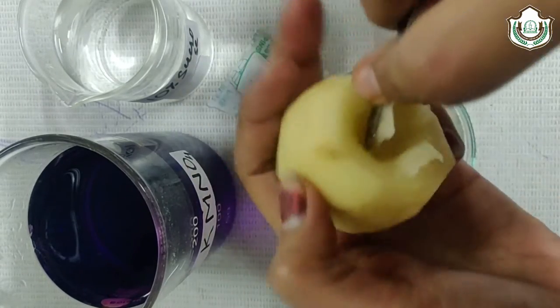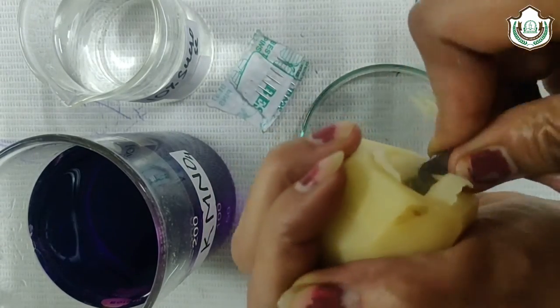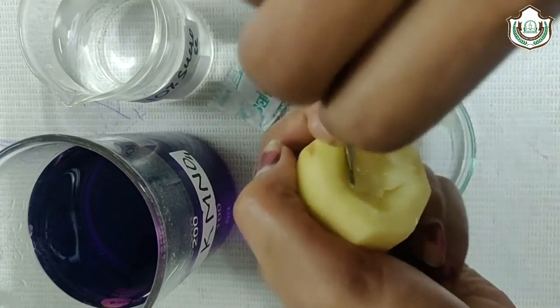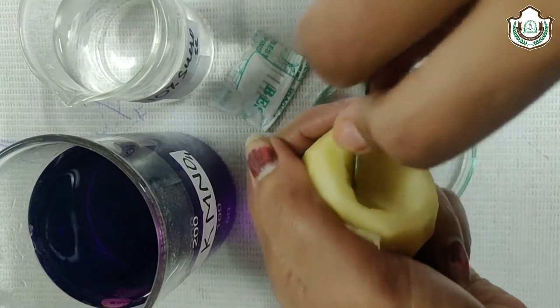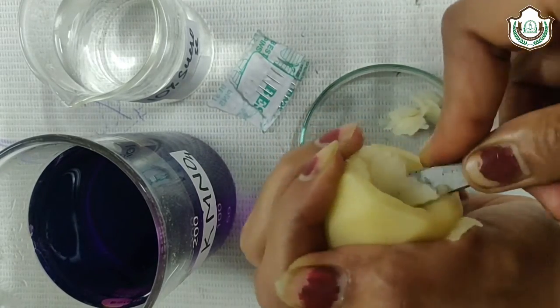With the help of scalpel, you have to make the thin wall of the potato so it can behave as a semipermeable membrane.